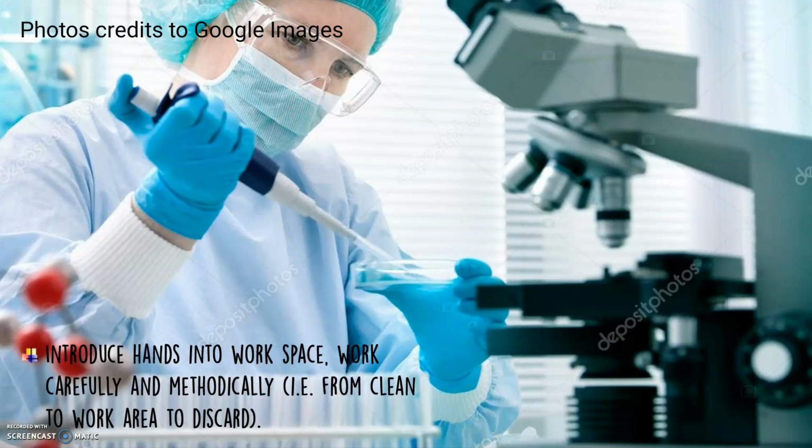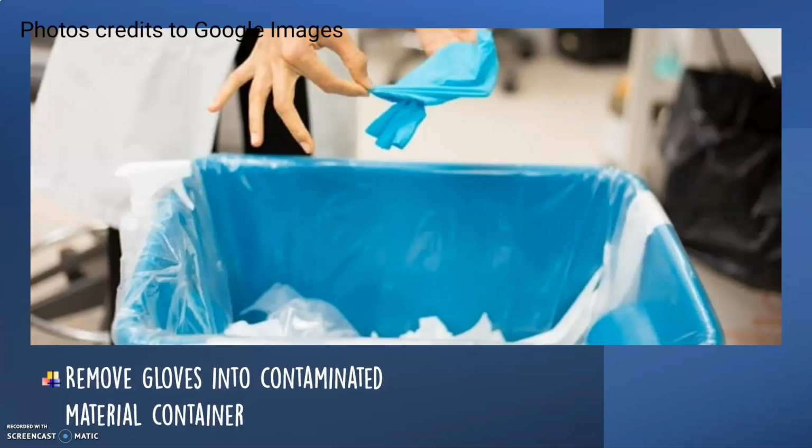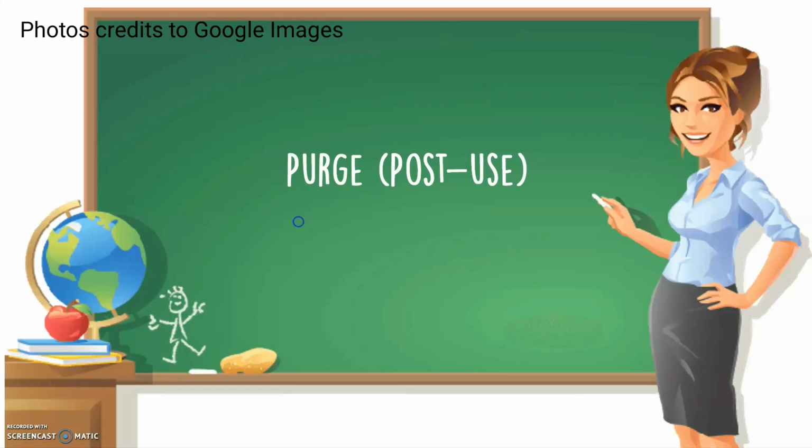It's really important that you are working in a very clean area to avoid contamination. Do not remove hands from the workspace until procedures are complete and all critical material is secured. Remove gloves into the contaminated material container.